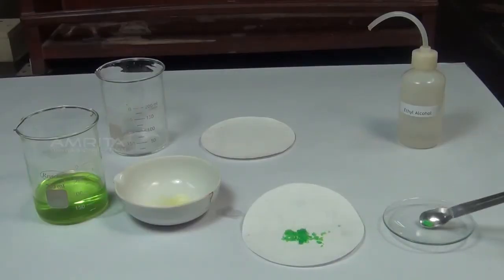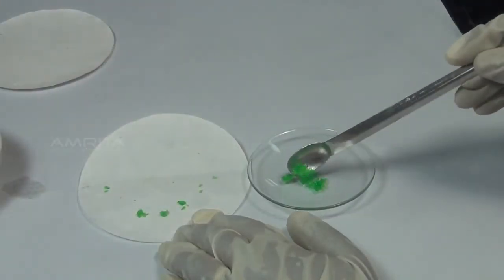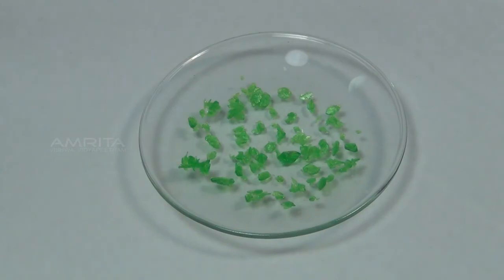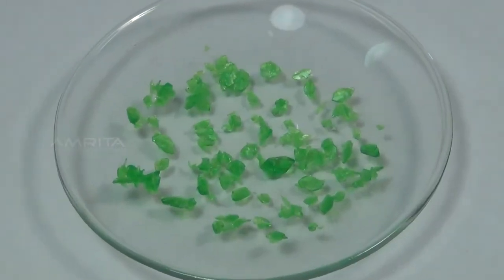Now transfer the crystals into a watch glass. The crystals of pure potassium trioxalatoferrate are emerald green in colour and are octahedral in shape.